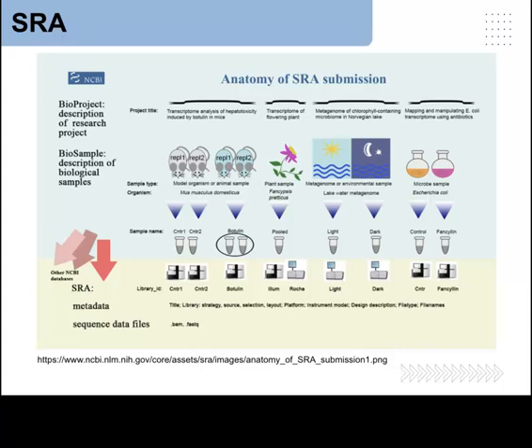So the BioProject, which was that first link that I pointed you to, that had the PRJNA prefix, refers to the BioProject, which will provide us more information about the research project, including the title of the experiment. Next, there was a link that was a BioSample with the SRP. SRP is going to be the study. So that will be the study that we will be looking at. The experiment is the SRX, the run is the SRR, and the submission accession is the SRA.